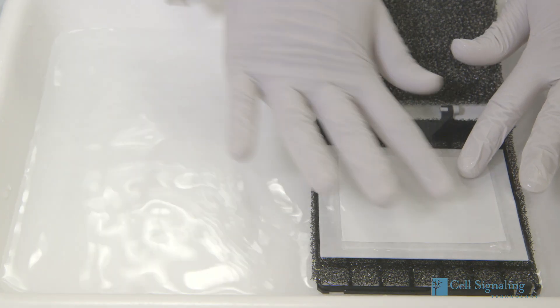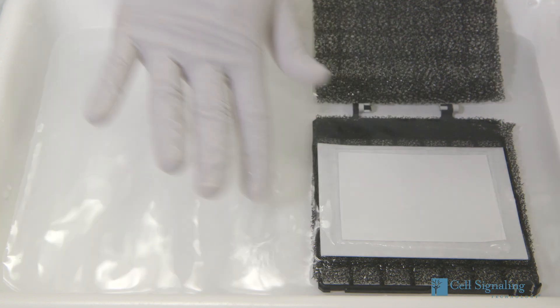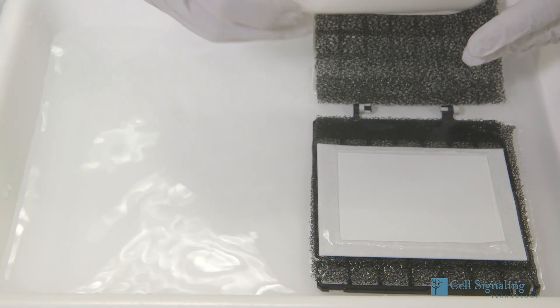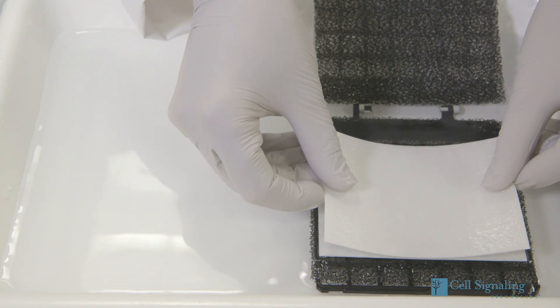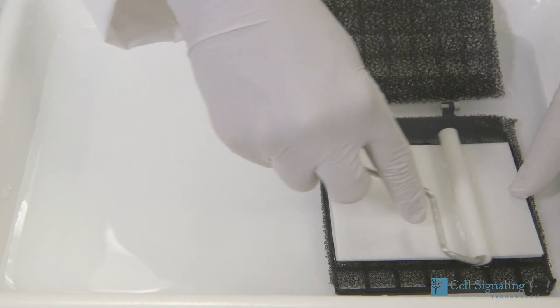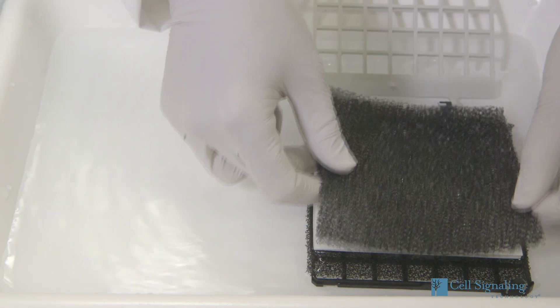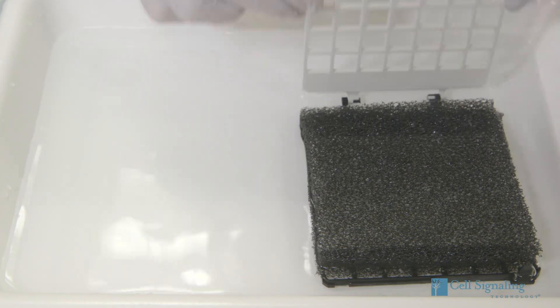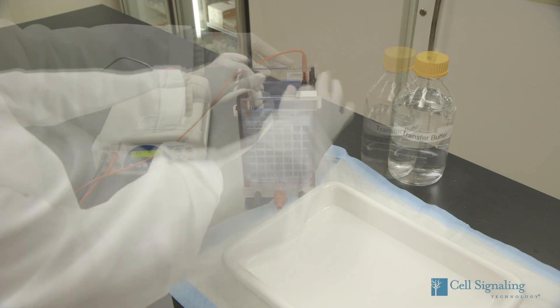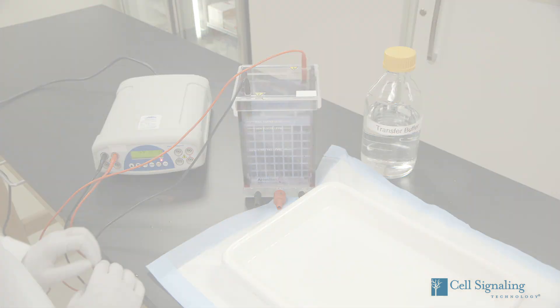When the gel is done, set up a transfer cassette and transfer buffer as follows: wet sponge, filter paper, gel, nitrocellulose or PVDF membrane, another filter paper, and sponge. Make sure to remove any air bubbles. Close the cassette and insert it in your transfer apparatus in the appropriate direction. Then electrotransfer under cooling conditions at 70 volts for 1.5 to 3 hours.